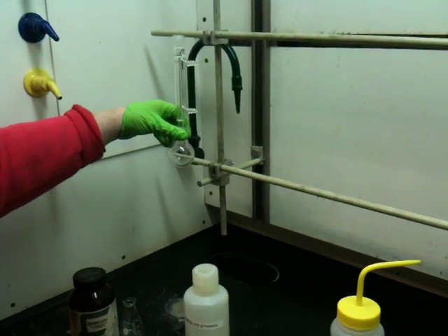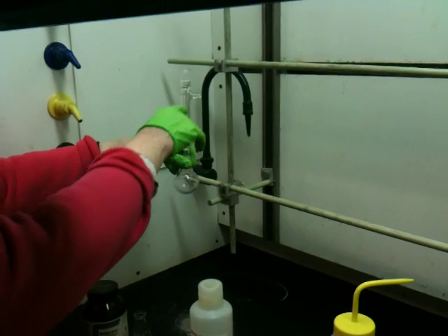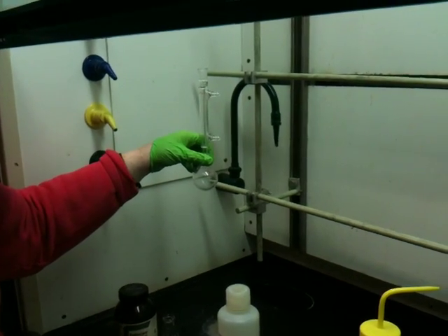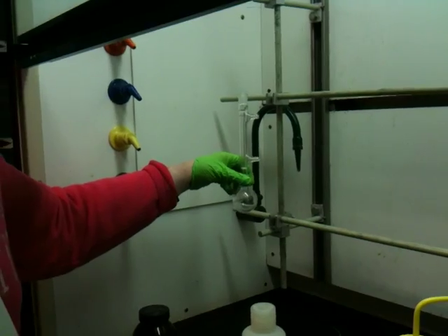That's a reflux apparatus. The idea is when the solution is boiling, the vapor will rise up, hit the condenser, and drip back down into the bottom so that the solvent is retained and doesn't evaporate off. That's the only glassware you need for a reflux.